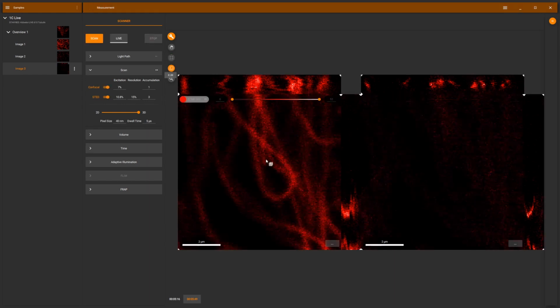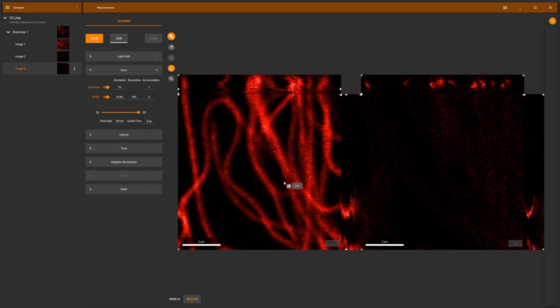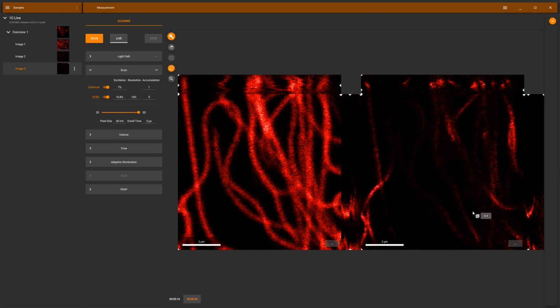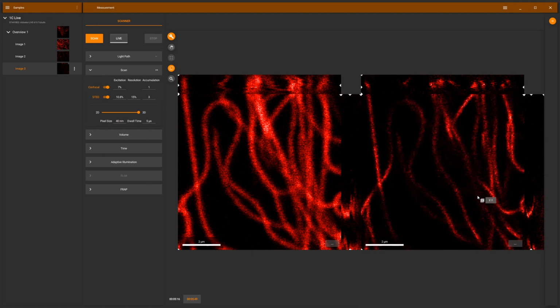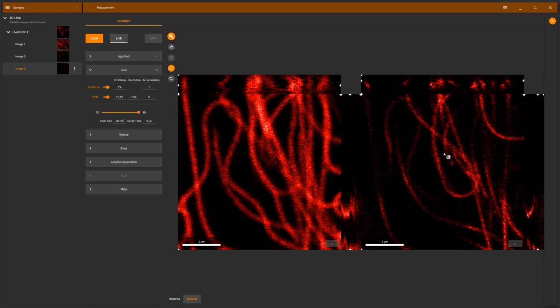Now this has run through, I'll go through the stack module. You see filaments in basically all planes, and here you have a much better 3D Z sectioning, so showing that these filaments are indeed lying on top of each other and being in independent levels. Now of course STED, while you see the dyes are quite stable, is still a little bit stressful for the cell, so we want to minimize the light dose as much as possible.